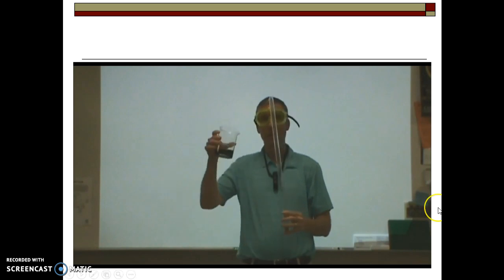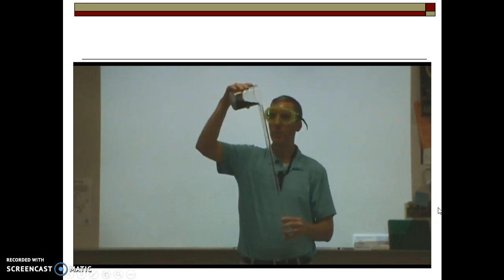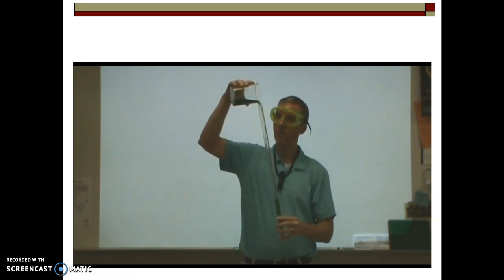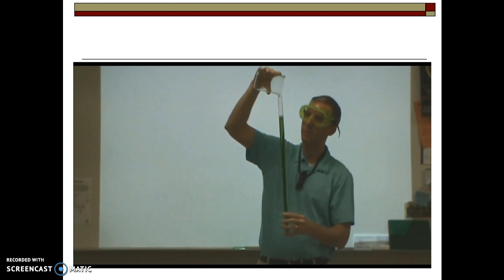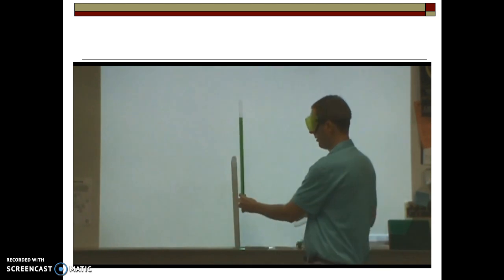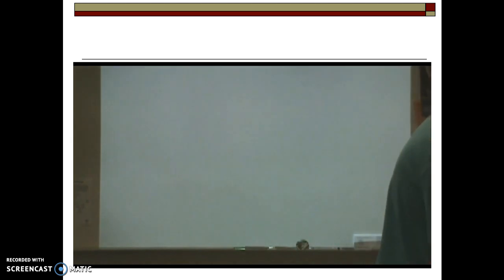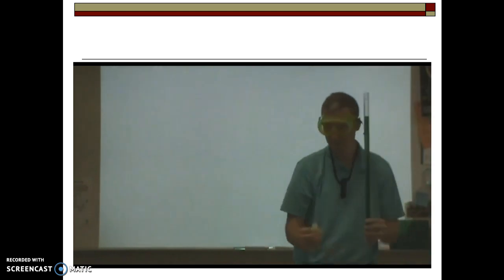And this is a nifty little demo we call the rainbow tube. He's got a solution there that is putting in a nice glass tube, and as you can see, it's kind of an emerald green color.